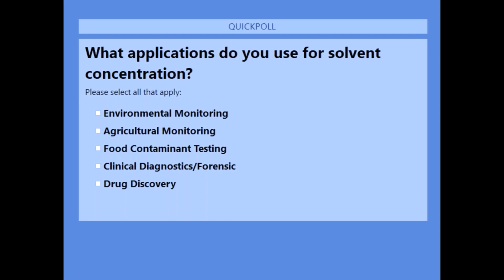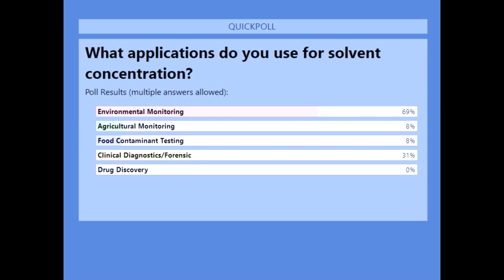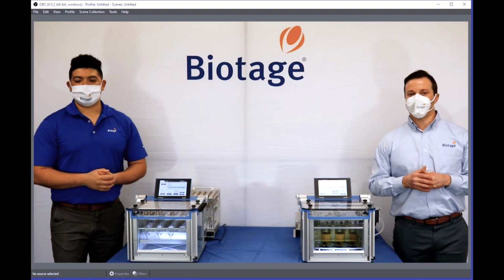All right, I hope your answers are in. Great. It looks like we have a lot of folks from the environmental market. So we're going to show you the flexibility and versatility of the environmental market and also other applications for the TurboVap systems.